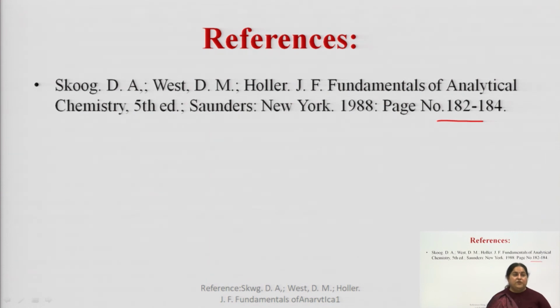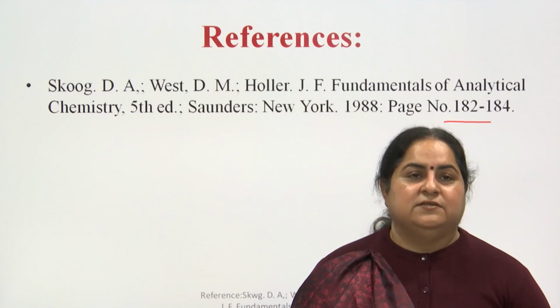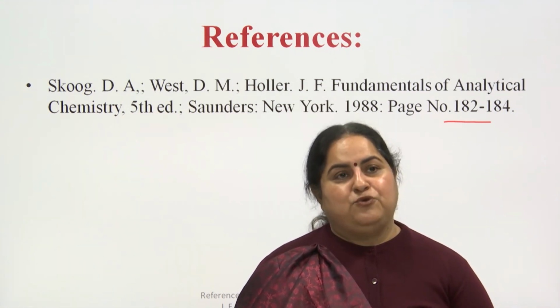So, earlier this was a very primitive method, right. It was almost an obsolete method which has been revived due to the addition of spectrophotometric determination of pH. Earlier it was done by visualization with the eyes, but now it is done by the spectrophotometer.